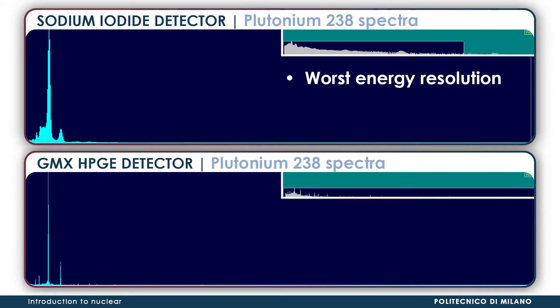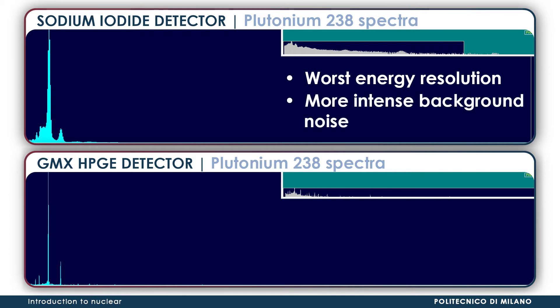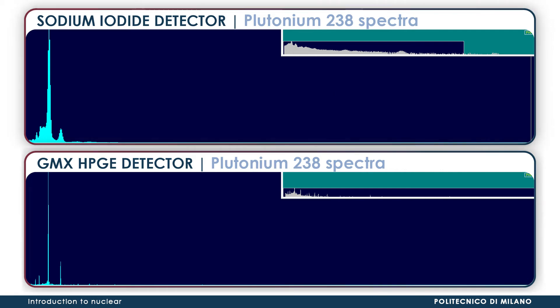Moreover, the spectrum acquired from the sodium iodide is characterized by a more intense background noise, due to the absence of a shield, which makes the lowest peaks difficult to discern.